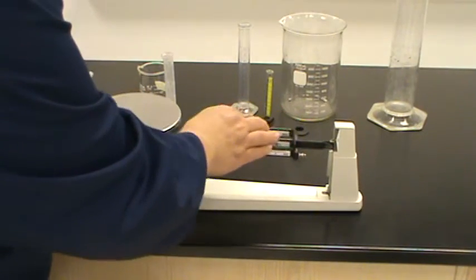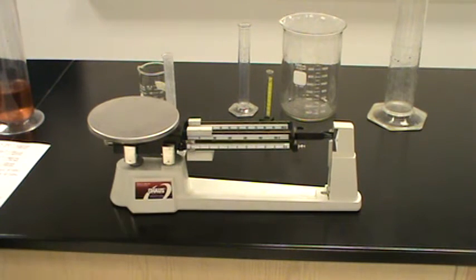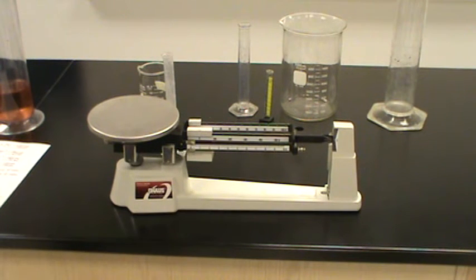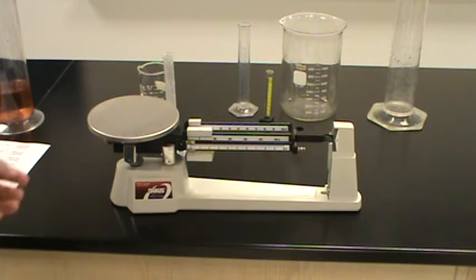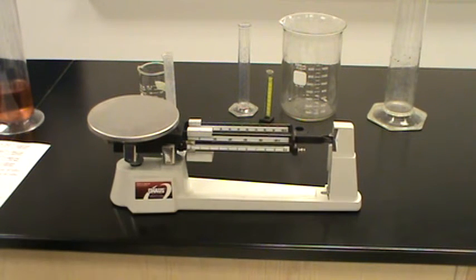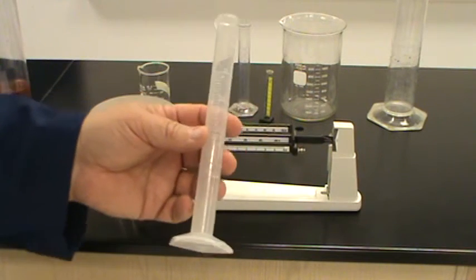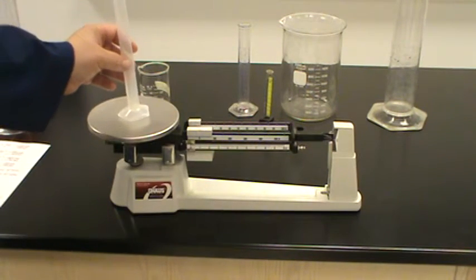I'm going to make sure that this one zeroes out first so we can get started. And I'm waiting. It's just a little heavy, or a little light, sorry. So I'm going to run that in about a quarter turn on the adjustment. I'm going to stand here behind you while we look, and sure enough, it's weighed in right there at 0, matching up.